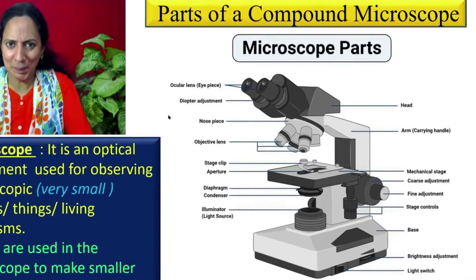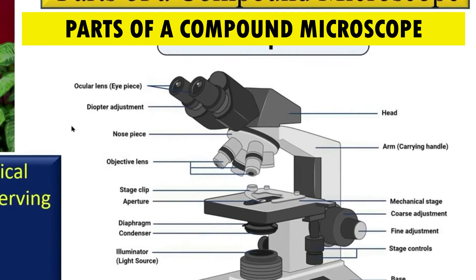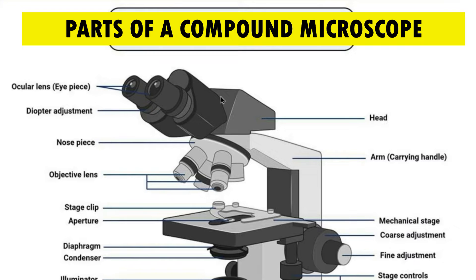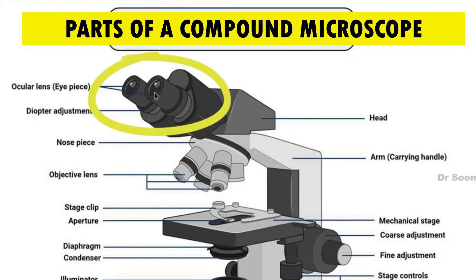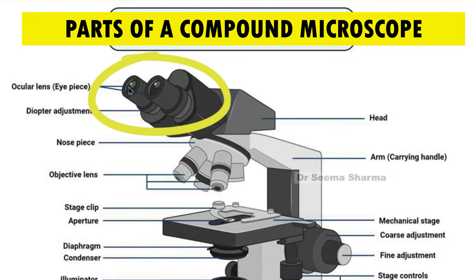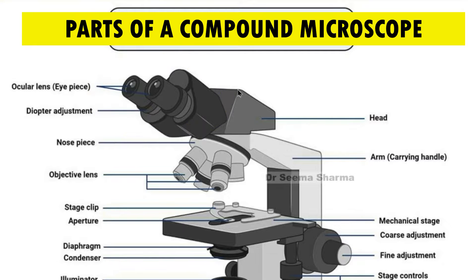First, basic parts of a compound microscope. We are starting with the top part. First is eyepiece. There are two eyepieces in this compound microscope. They have ocular lenses in them for magnifying the image of the object.